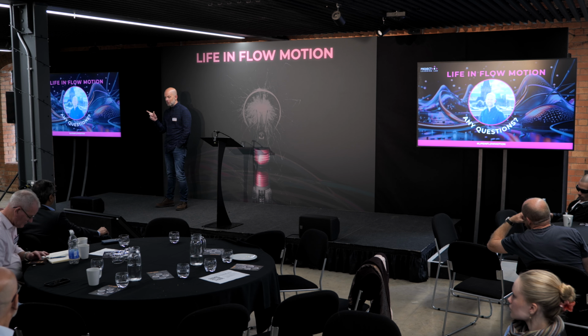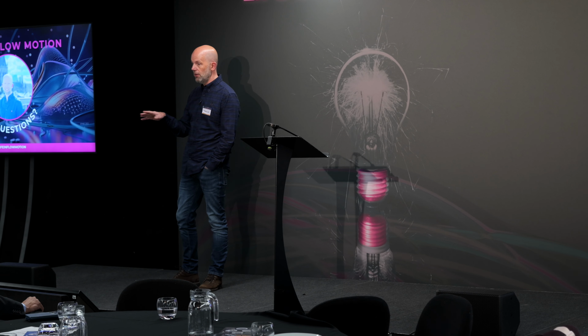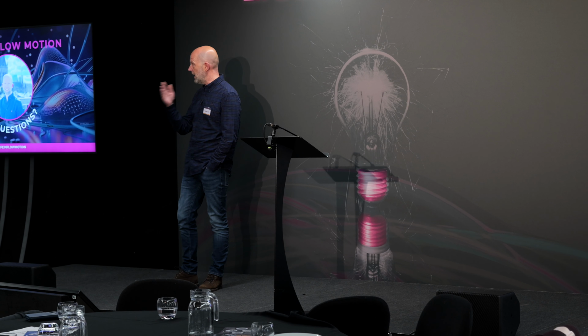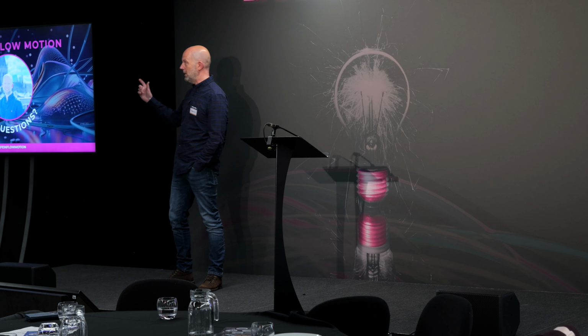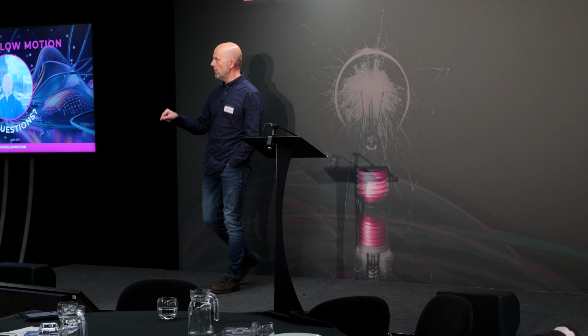It is. So first one, cycle times come down. Some come down and become reliable and predictable. So for most oral solid dosage, that's your tablets, there's no reason why they can't go through a lab in 3 days. And it gets to 3 days. And with the stability samples, you have a regulatory requirement to analyse those samples within 1 month of the pull.